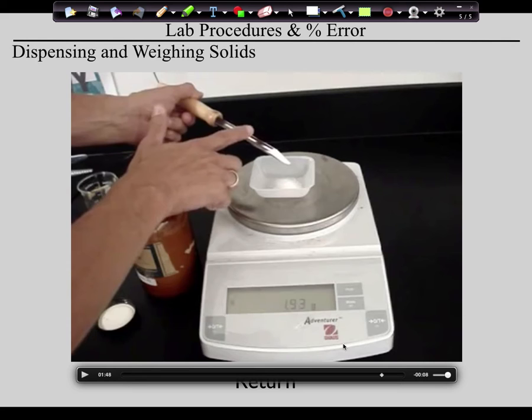But understand, we're not talking about biologically contaminated. We're talking about chemically contaminated. It's not like a needle you don't want to stick yourself with. It's that we just don't want other chemicals on there. So, you guys okay with that?